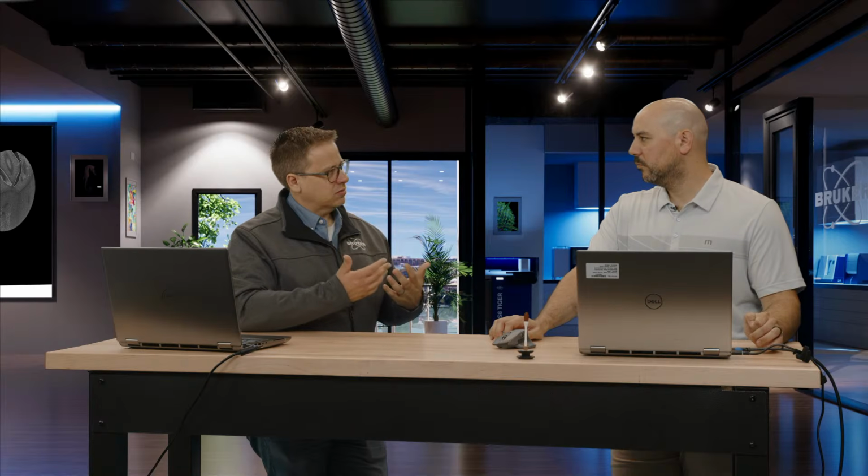A lot of our users out there, especially benchtop, might be novices. They're just starting out. Now this might be making them a little afraid, right? Like, oh my gosh, I never knew what I was missing. What are some little tips? I know you have one for the power. What do you generally recommend for your power setting, for resolution and power?